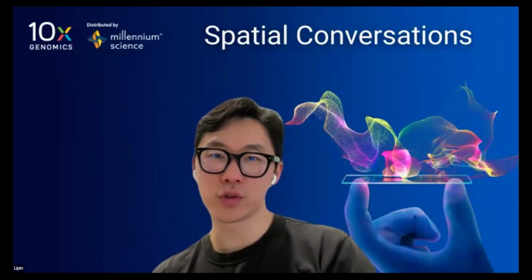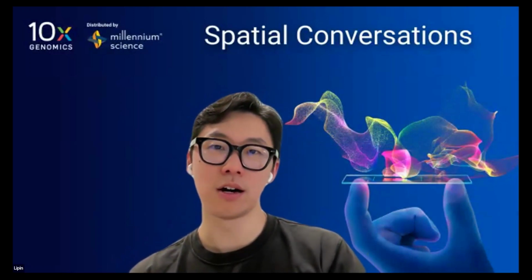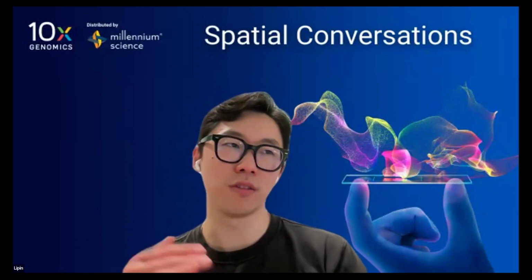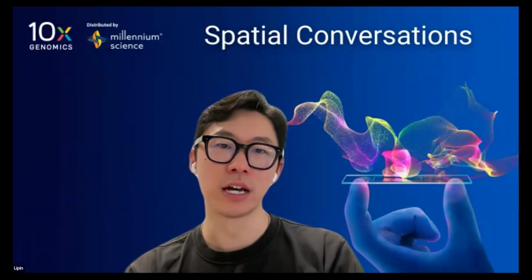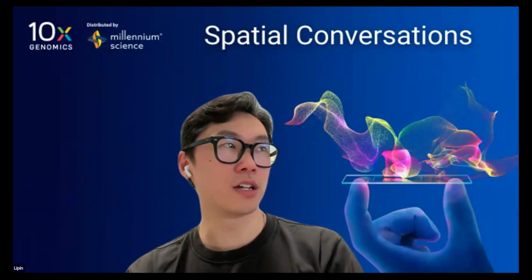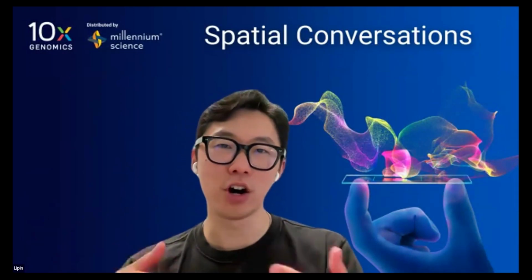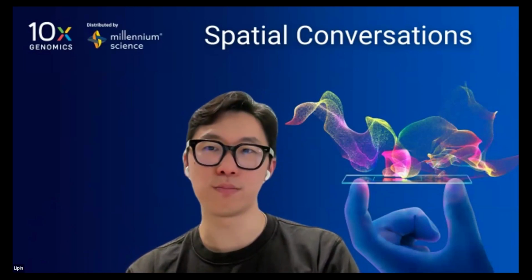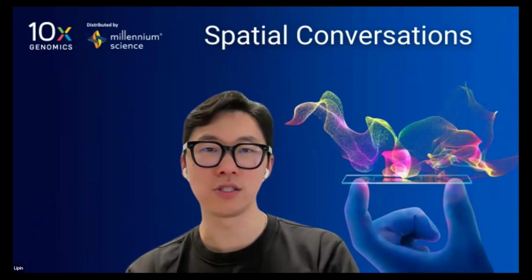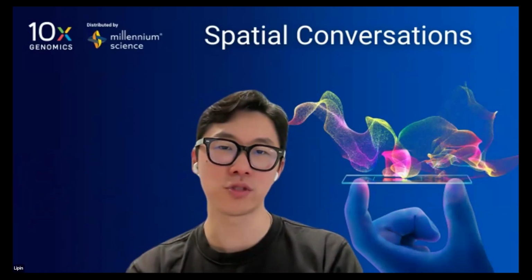If you know how to run Seurat for single cell, the jump is not that steep. It's basically just following instructions. But if you don't know how to run anything in R, it can be quite difficult. You need to learn how to operate that. But if you have the basic skills of using R and plotting things, it's quite easy. You just load your libraries and follow the instructions.